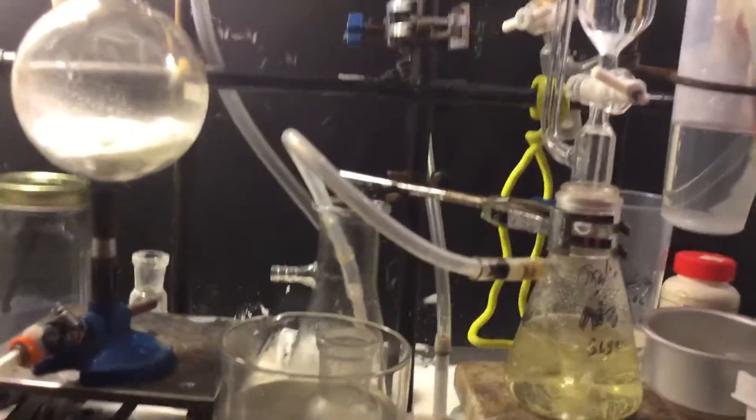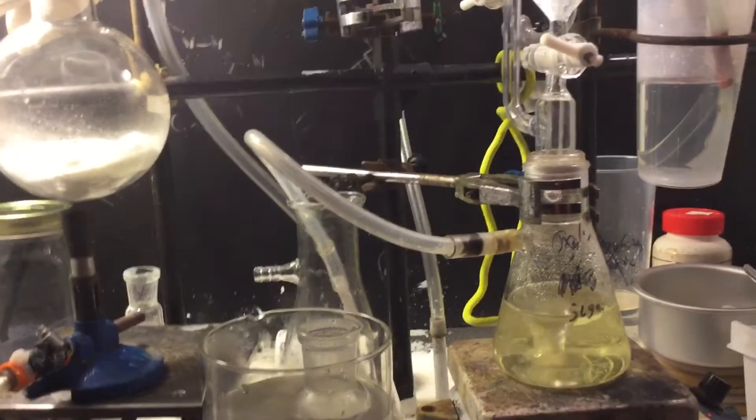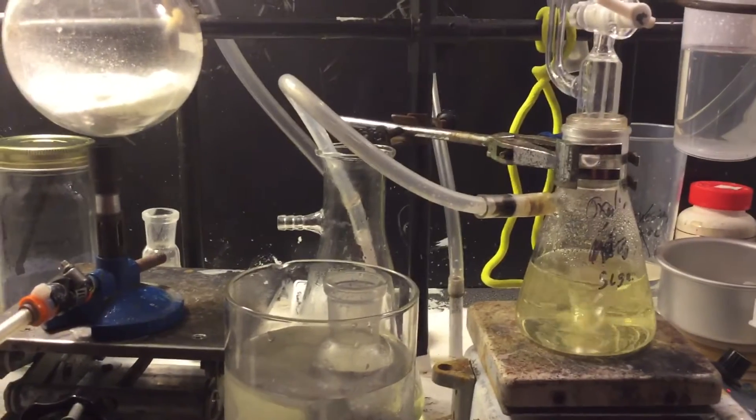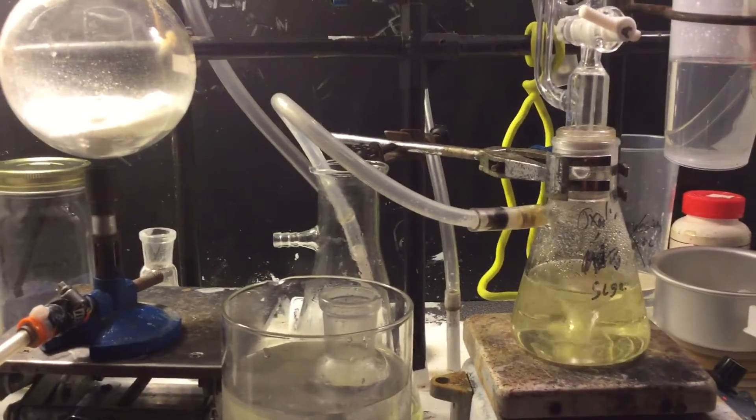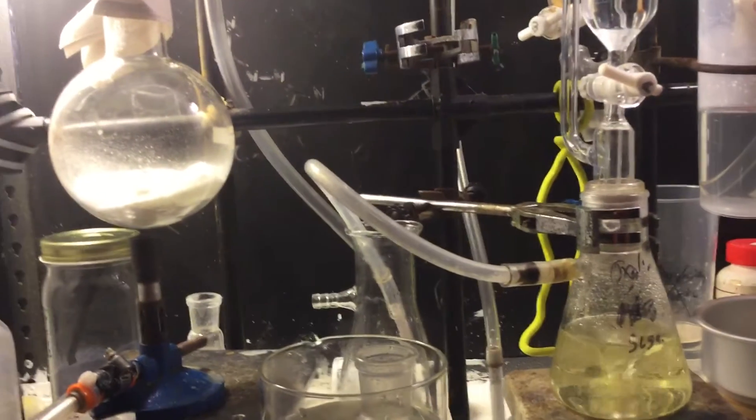There are two methods for the synthesis of p-toluenesulfonyl chloride. The method I was going to use was using chlorosulfuric acid, just mix it with toluene, keep it in an ice bath for 12 hours, heat it a little bit, and ta-da, you have your p-toluenesulfonyl chloride.